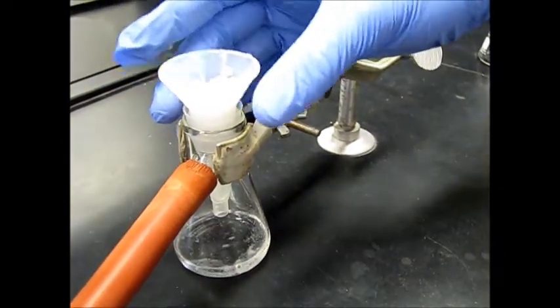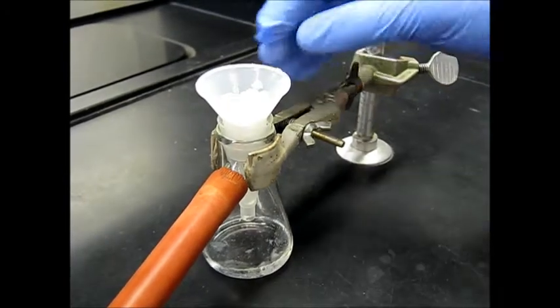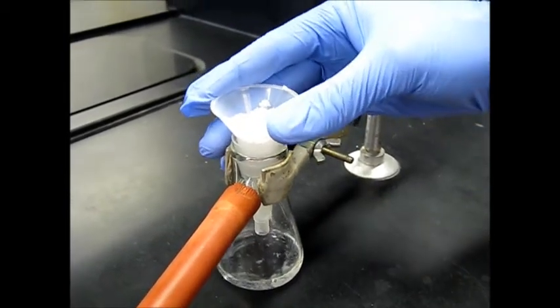According to the procedure, we're supposed to let it air dry after that rinse for 5 more minutes. So we'll check back in after 5 minutes and finish out this last part.